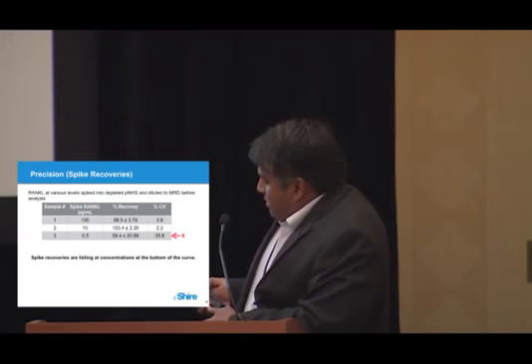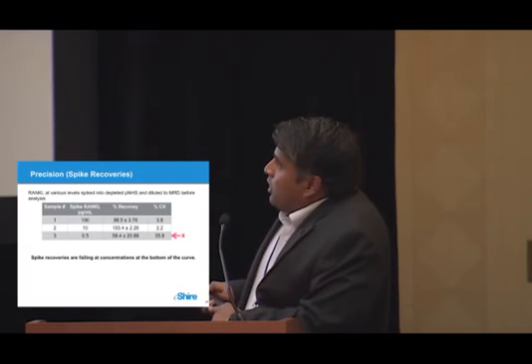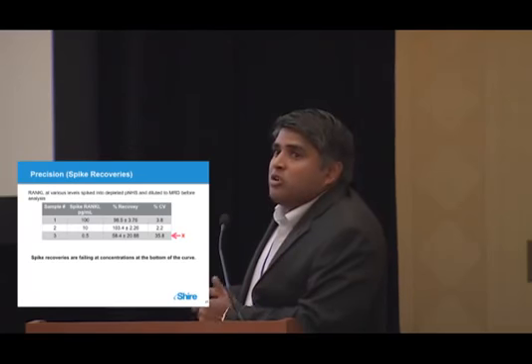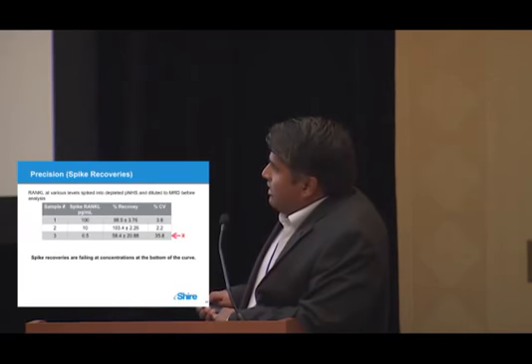Dynamic range, 100 femtograms per ml. I wanted to bring to attention that limit of detection is different from dynamic range, and I'm going to show more data about that. CVs look good, 4PL it is, and the calibrator is the same one that I'm using from R&D Systems. It's a recombinant RANKL.